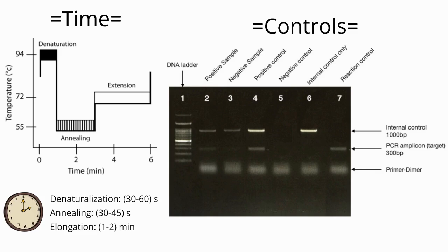It's also useful to have an internal control that can serve as an indicator for proper nucleic acid purification, reverse transcription control, normalization reference, as well as PCR inhibition supervision. There should be a difference of maximum 12 amplification cycles between the internal control and the target gene.